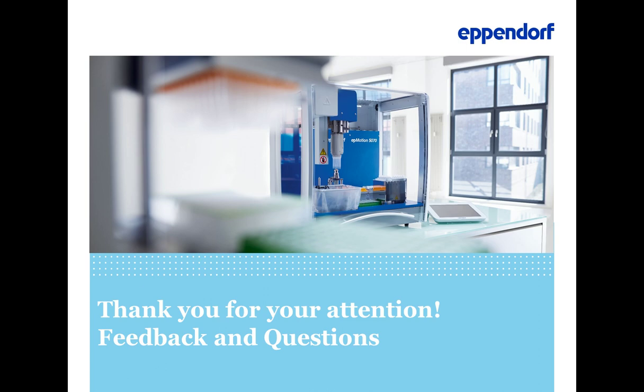Good question. I mentioned that in one of my slides. The term of technical and biological replicate is something that I used during qPCR experiment, and I think it's sort of widespread, but sometimes people don't really know what it is. So for me, the best explanation is a biological replicate. So let's say you want to correlate the expression of a certain gene with a certain condition or with a certain set of donors. So a biological replicate would be to have several donors or blood samples where you suspect them to have the same treatment. That would be a biological replicate.